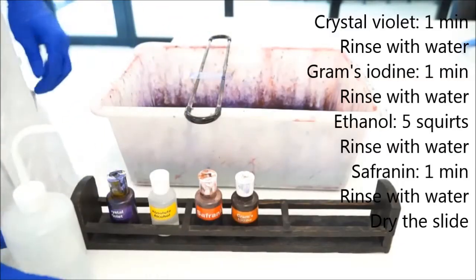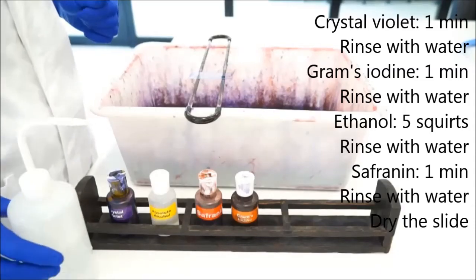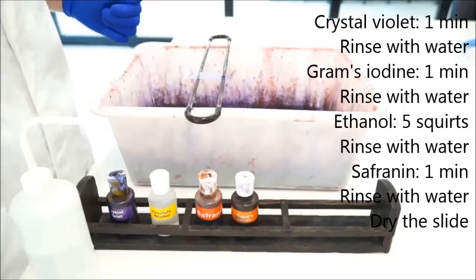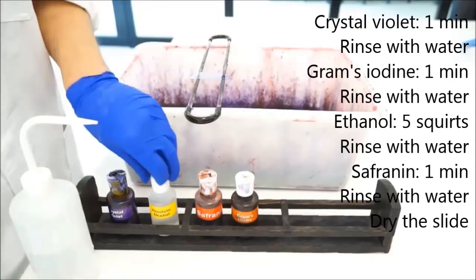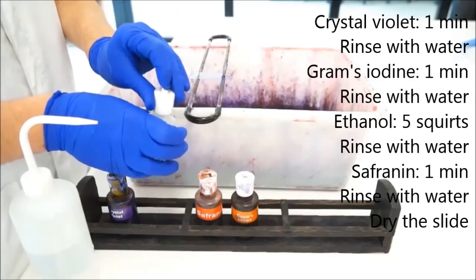The next stain is the Gram's Iodine. Let's just pretend that I've done that in the same way. I want to rush through to the very important differential part of the differential stain, which is using the Absolute Alcohol. Again, pop that lid right up.